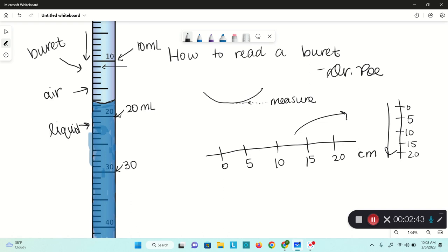Here we see 10 at the top, and we see 20 here, and the value is going to be immediately in between. We're really looking right about here in this purple pen color to find the bottom of the meniscus, and that's the volume that we need. We know this number is going to be between 10 and 20 because of the numbers that were given to us on the burette.